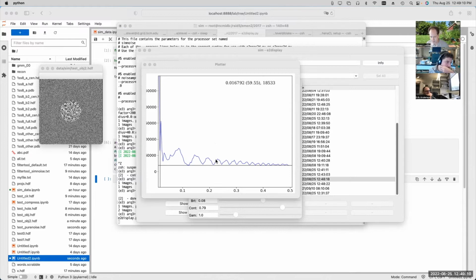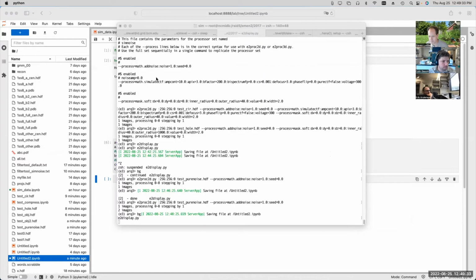Or anyway, since we're not putting a hole in the noise anymore in this approach, we could actually use the filter tool to manually adjust this, right? Because we could read the circle that we cut out in as the raw image, and then we could just add noise to that image until we were happy with the level. All right, so I think that's probably most of what I wanted to say about noise simulation.